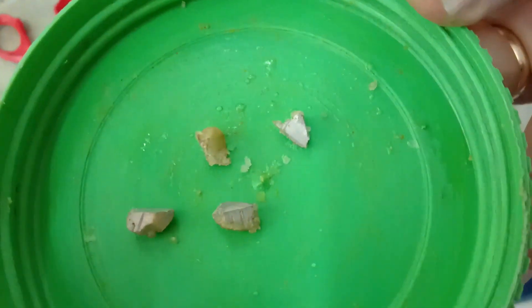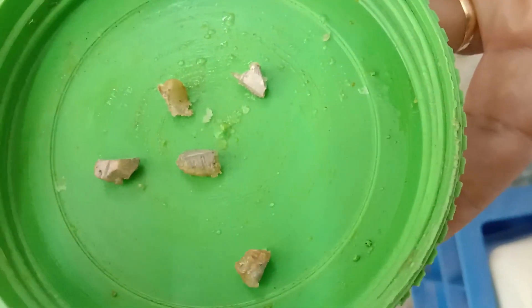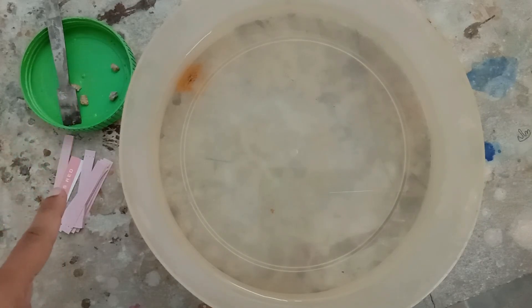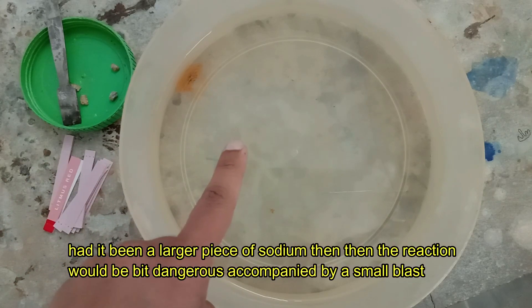I require only a very small part for this experiment. Sodium is a very soft metal — it can be cut very easily with a knife. For this experiment I have taken small pieces of sodium, red litmus paper strips, and a container filled with water.